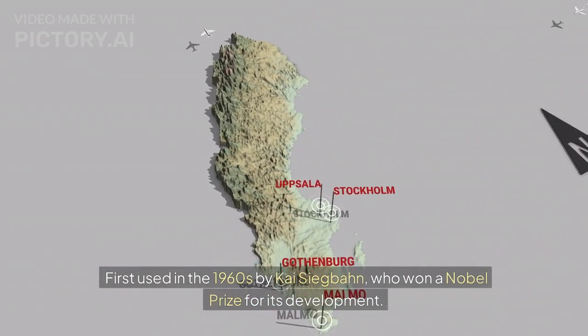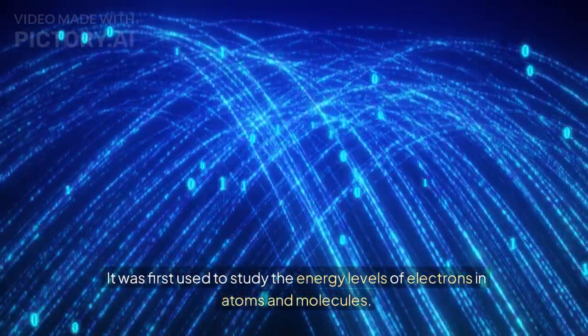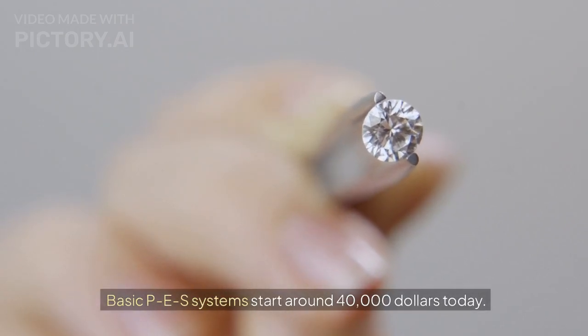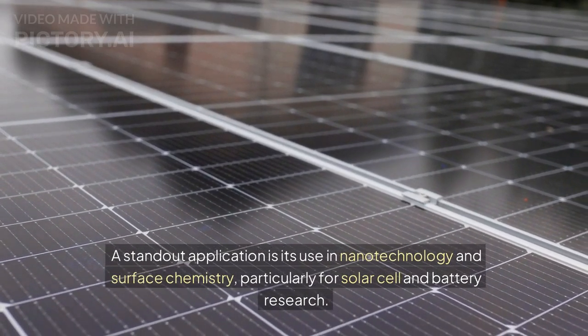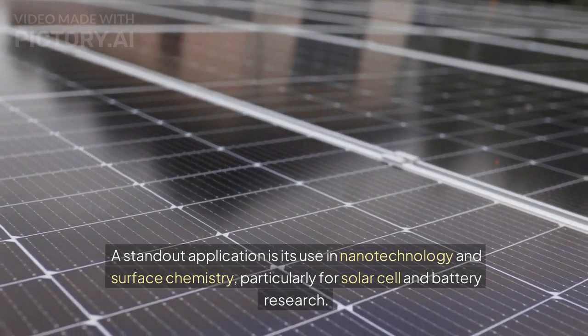Photoelectron spectroscopy, PES, first used in the 1960s by Kai Siegbahn, who won a Nobel Prize for its development. It was first used to study the energy levels of electrons in atoms and molecules. Basic PES systems start around $40,000 today. A standout application is its use in nanotechnology and surface chemistry, particularly for solar cell and battery research.